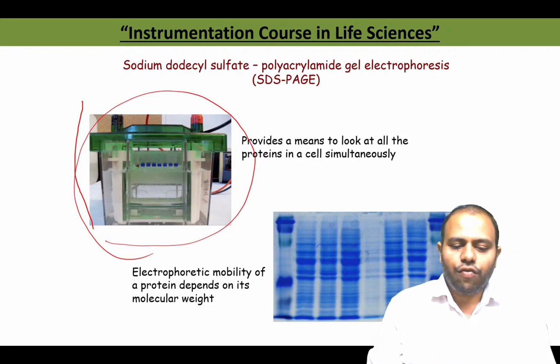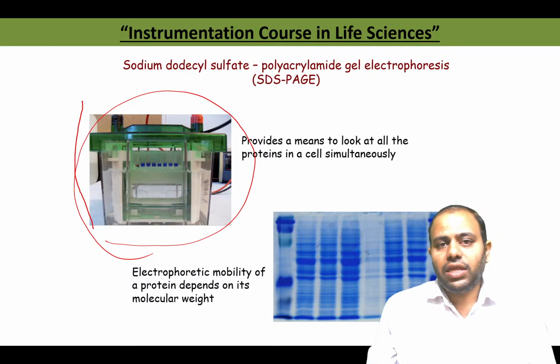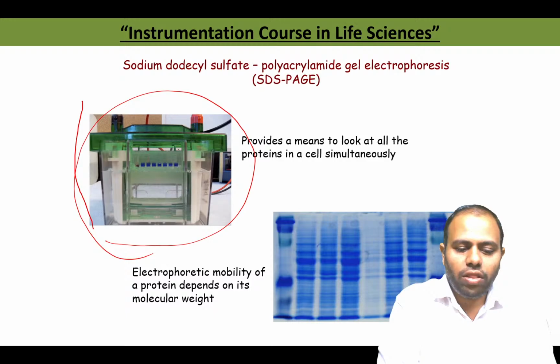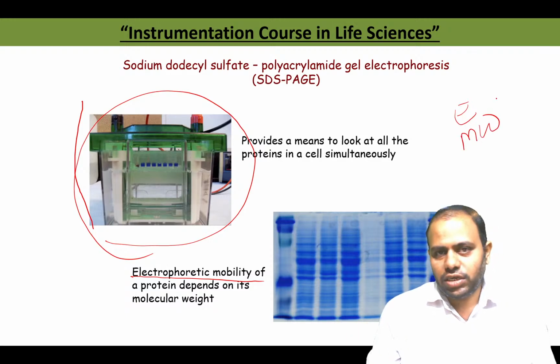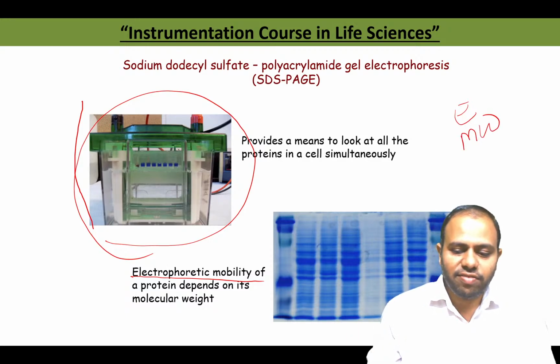The electrophoretic mobility of the protein, that is, how it is going to move in the SDS PAGE gel, depends on two things. First is the electric field, and second is its molecular weight.